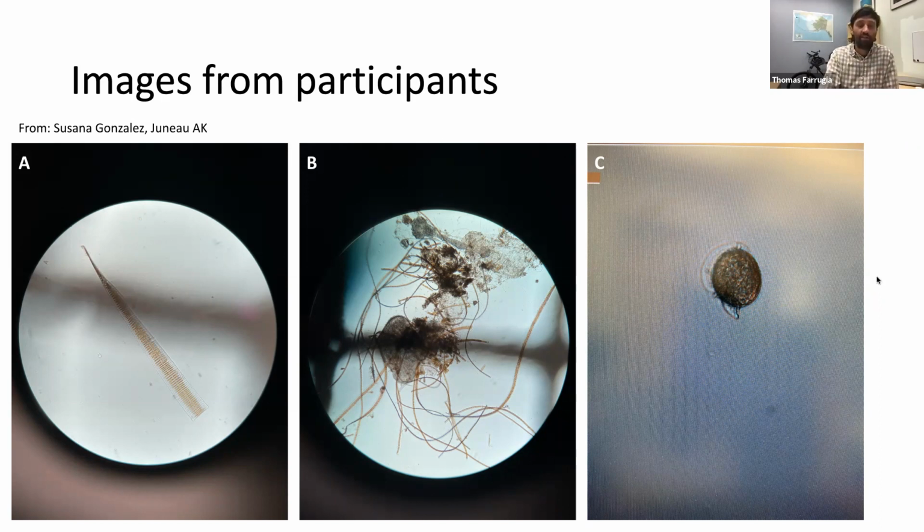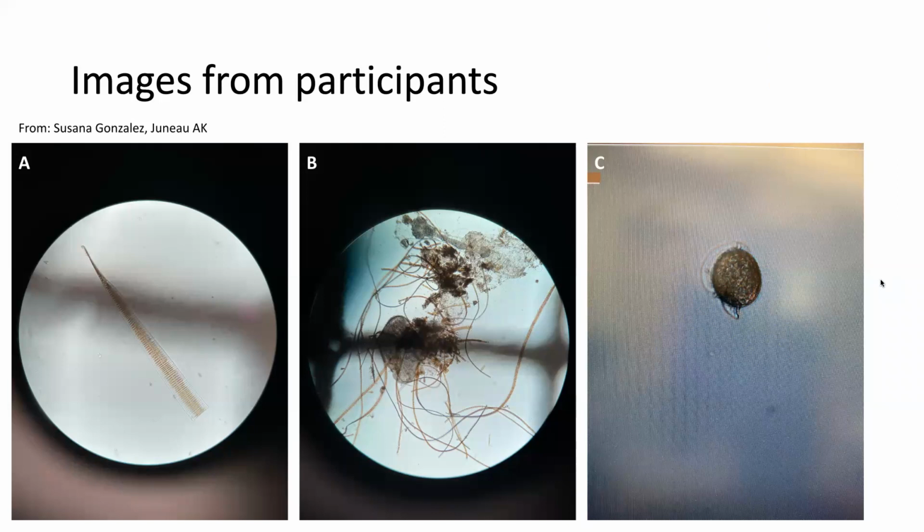But microscope work is another workshop that we may want to put on later, maybe once COVID dies down and we can have more in-person workshops, because that's a whole other part of this process too. These were great images to stump the experts. I would suggest, though, if they're going to send an image, at least give us an idea of the magnification they're using.